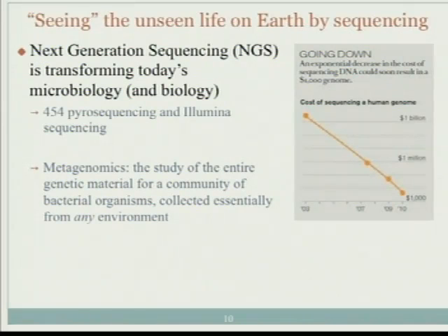And also you don't need to have... How do you only focus on 16S? Yes, I will show that, but mainly you can use primers that target 16S genes only, so that you only amplify genes from 16S, and then you do sequencing.